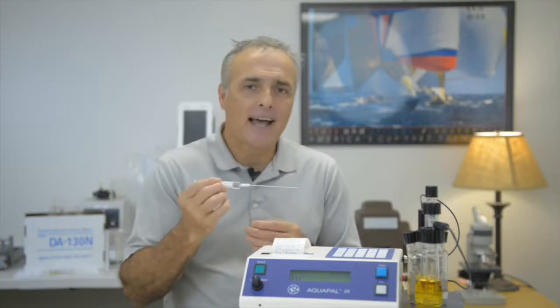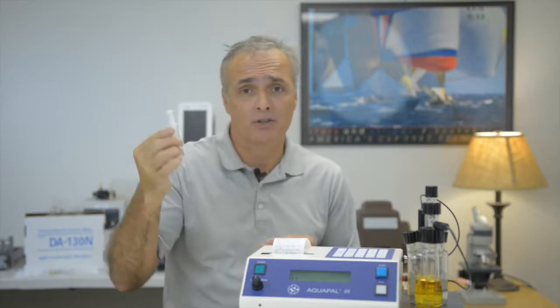It's pretty straightforward. For the pros and cons, you need to have a good syringe, something where you're confident that you're actually getting 1 mil in there, because it's based on the volume, and we're really eyeballing that volume. It's really what we see. There's no way to measure it other than to visualize that 1 mil is there. Obviously, if it's a 1 mil syringe, yes, but you could have some in the headspace of the syringe. So getting the right volume is important. The test just finished. And knowing the specific gravity, that's the other piece of information. If you have those two, you're able to do this very efficiently.